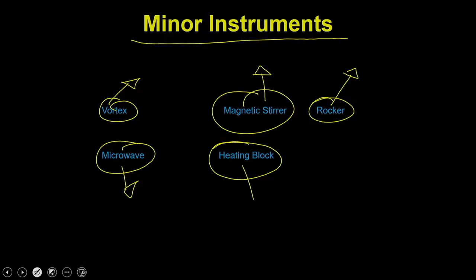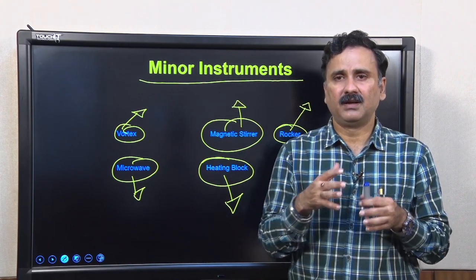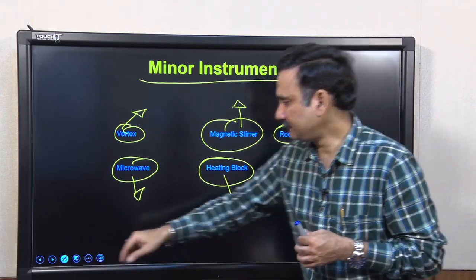And the heating blocks are required to prepare the SDS samples, and you have to heat up to 100 degrees and all that. So these are the minor equipment. They don't require special care, but you have to be a little careful that you clean them, and turn them off if you are not using them and all that.